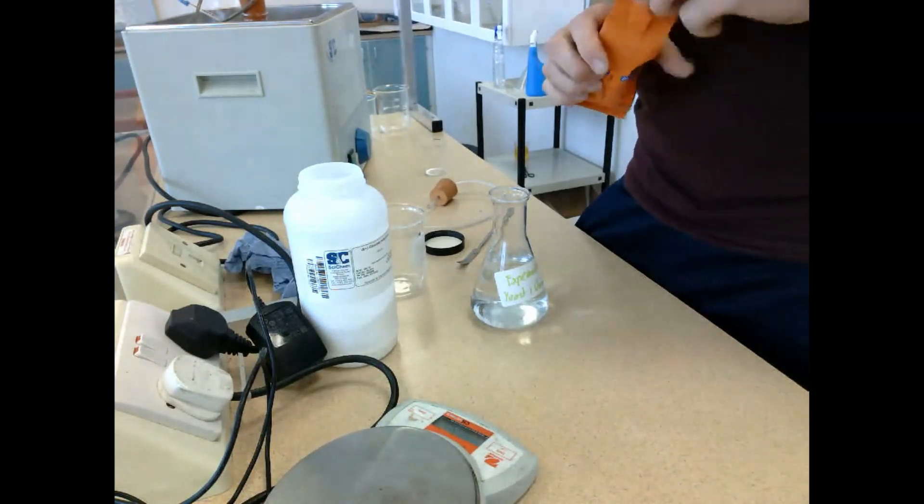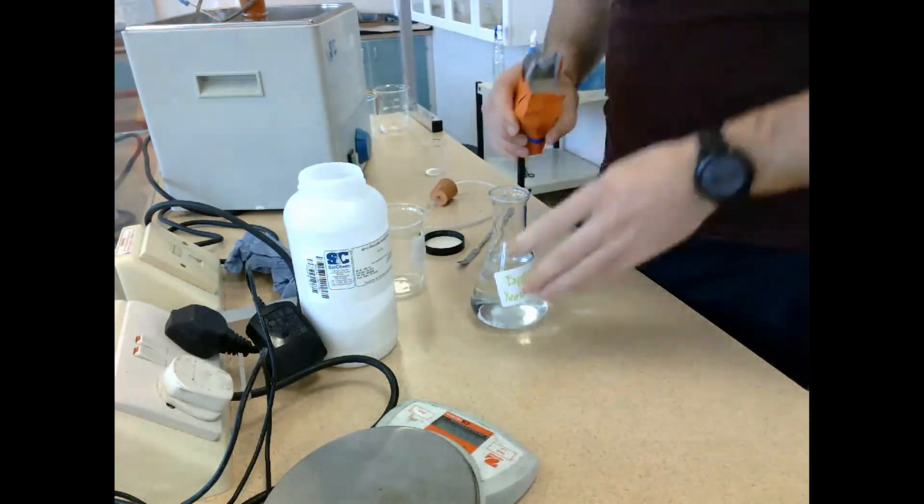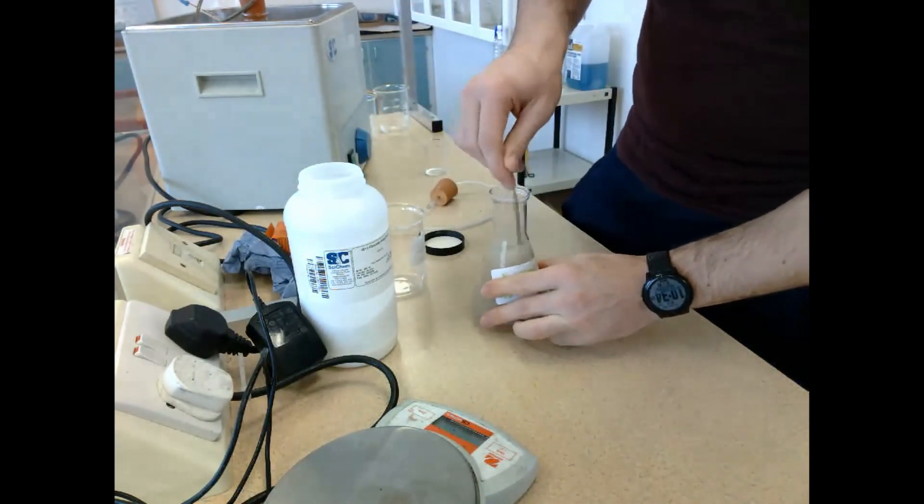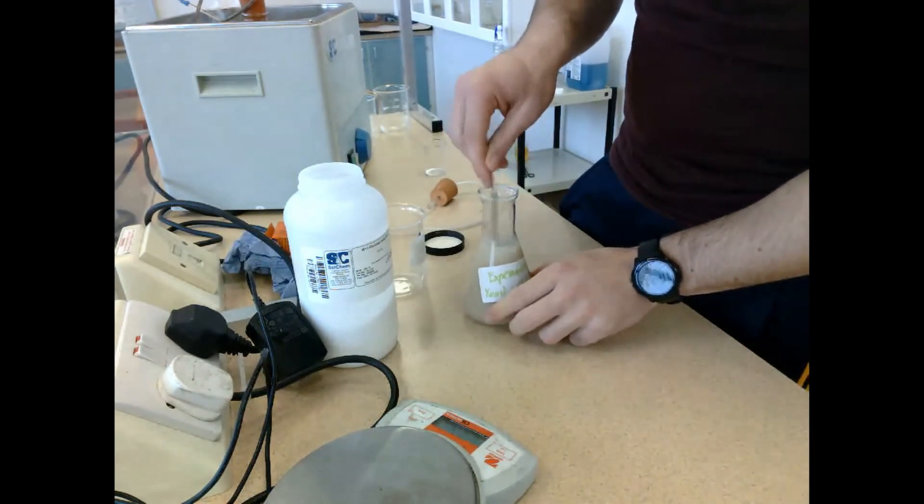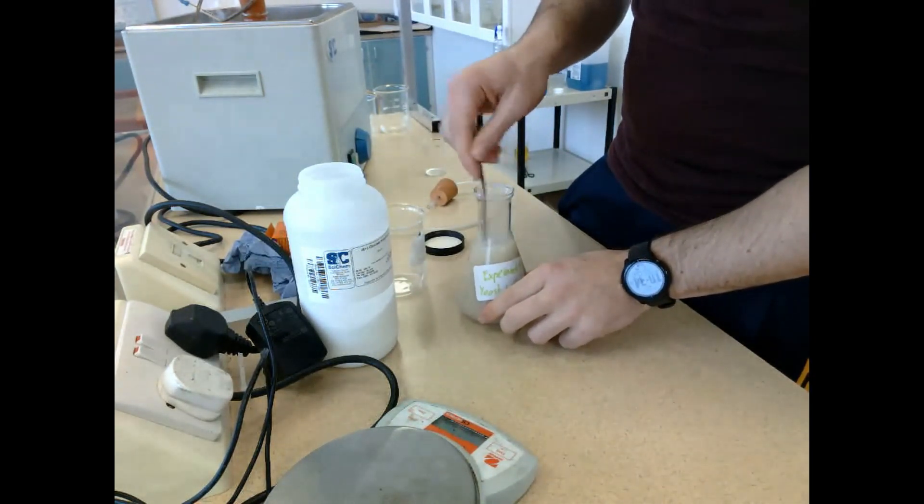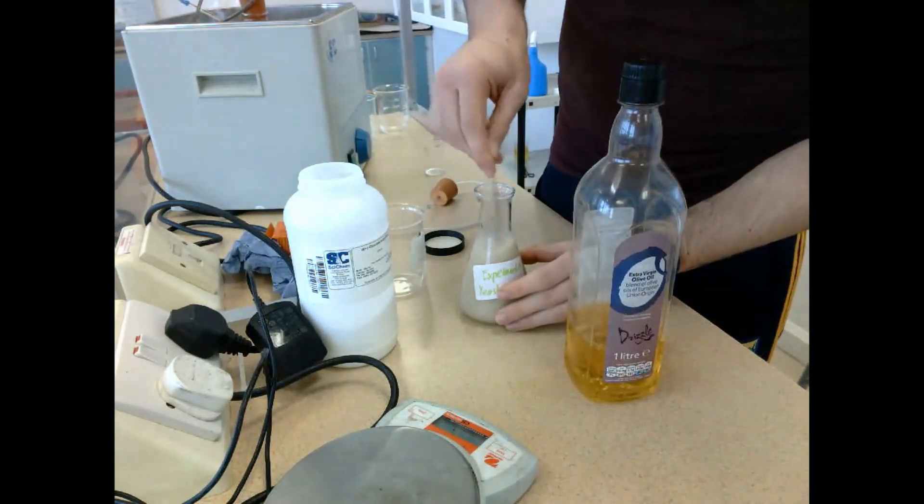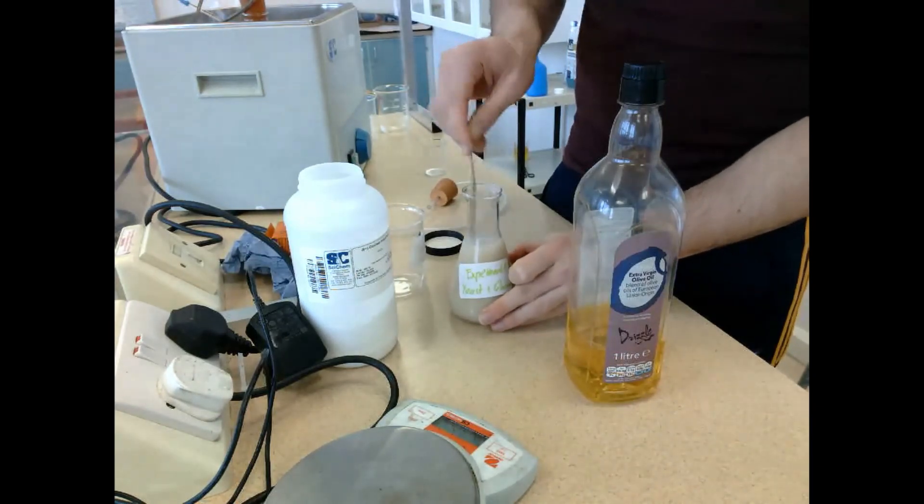Next, we take the second beaker and add it to flask two, but this time we're going to add yeast. We pour the yeast into this flask and then we stir it all together to ensure that the yeast is dissolved in the solution.